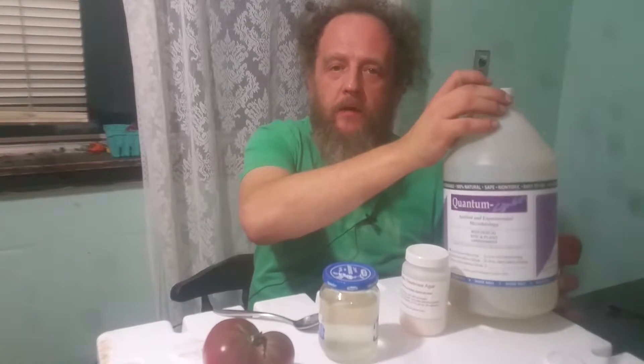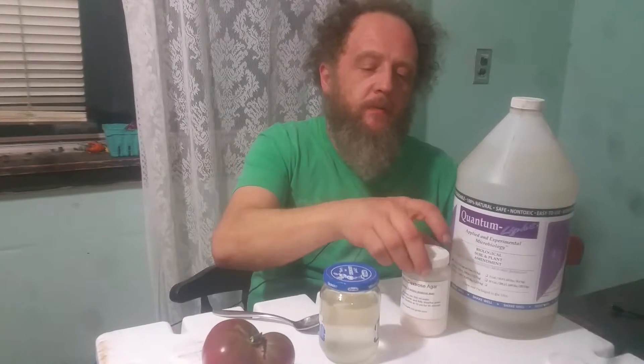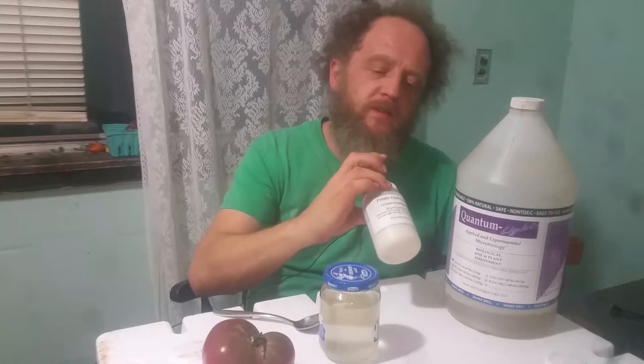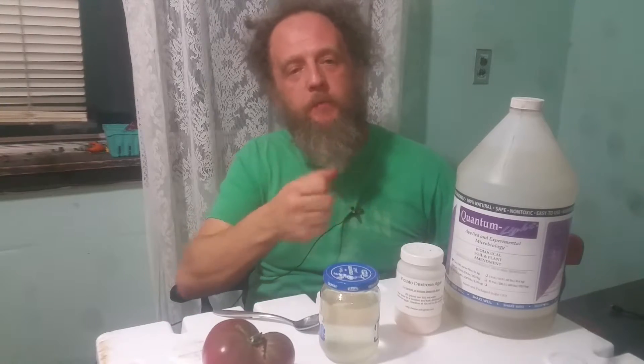What I am here today to talk about is this Quantum Light non-sulfur purple bacteria. We're going to do an experiment. We're going to take some of this potato dextrose agar, which is just potato sugar and agar seaweed, and it's made for petri dish gel to propagate different bacteria and stuff.